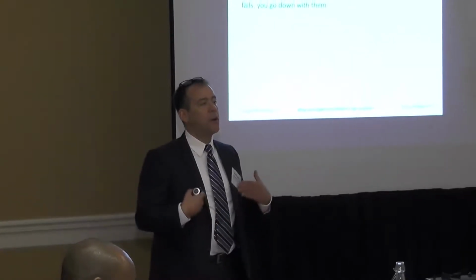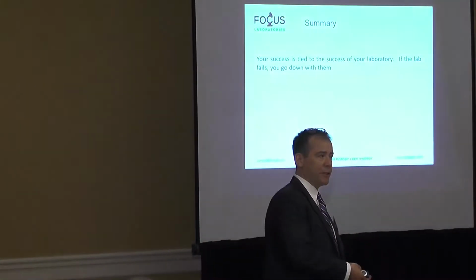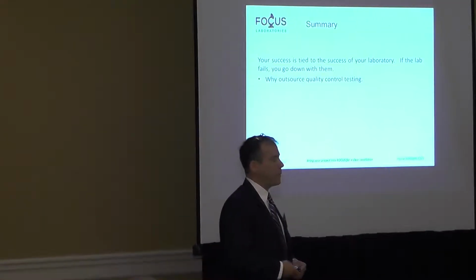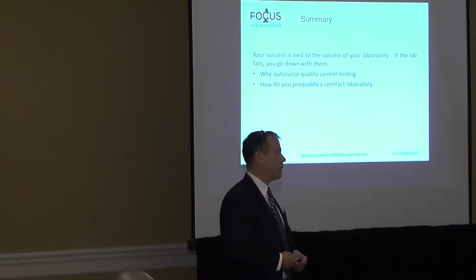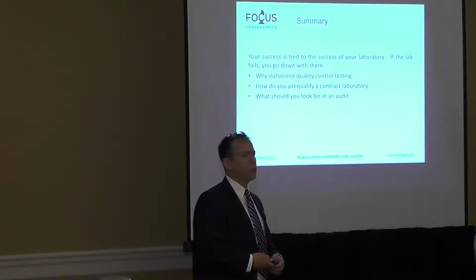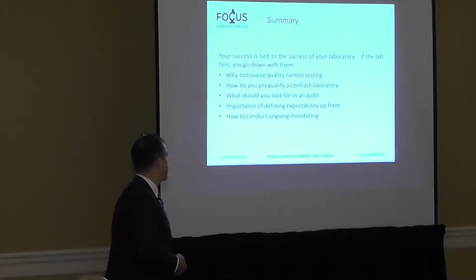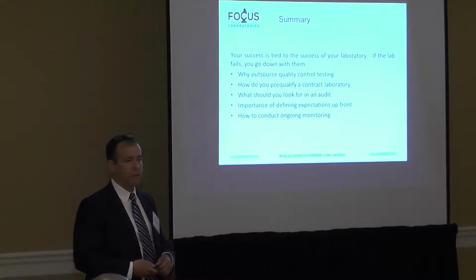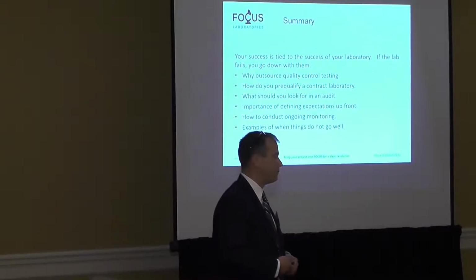In summary, as has already been said by both Catherine and Kelly, your success is obviously dependent upon the success of the person or the company that you're outsourcing to. We're going to talk about that. We're going to talk about why you might want to outsource QC testing. How do you pre-qualify a laboratory? There's a lot of us out there. What you should look for during the audit, the importance of defining expectations up front, and then how to conduct ongoing monitoring, something that we talked about again at the end of Kelly's talk. And then some examples of when things go wrong, and they do.